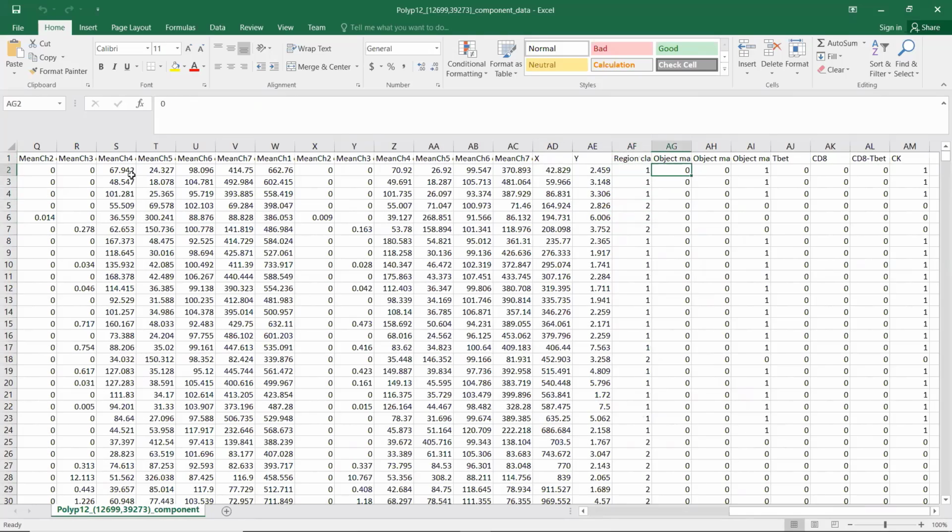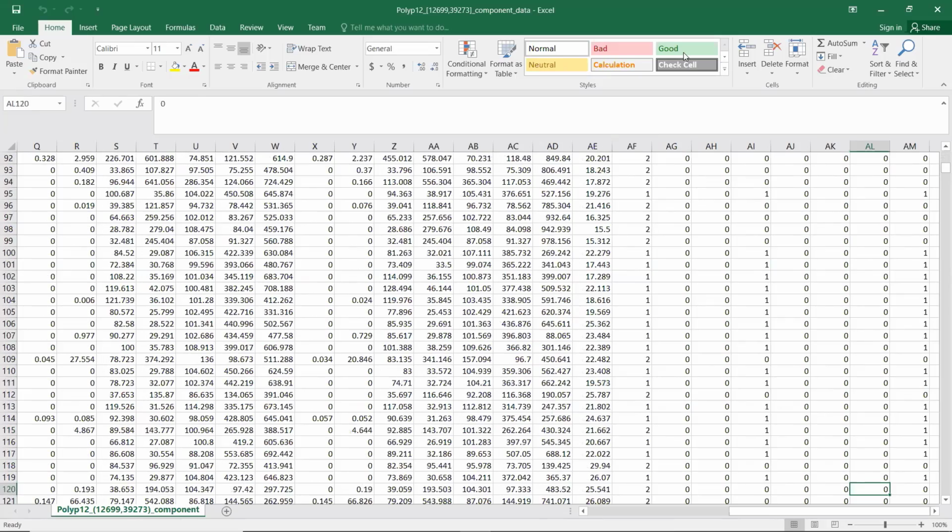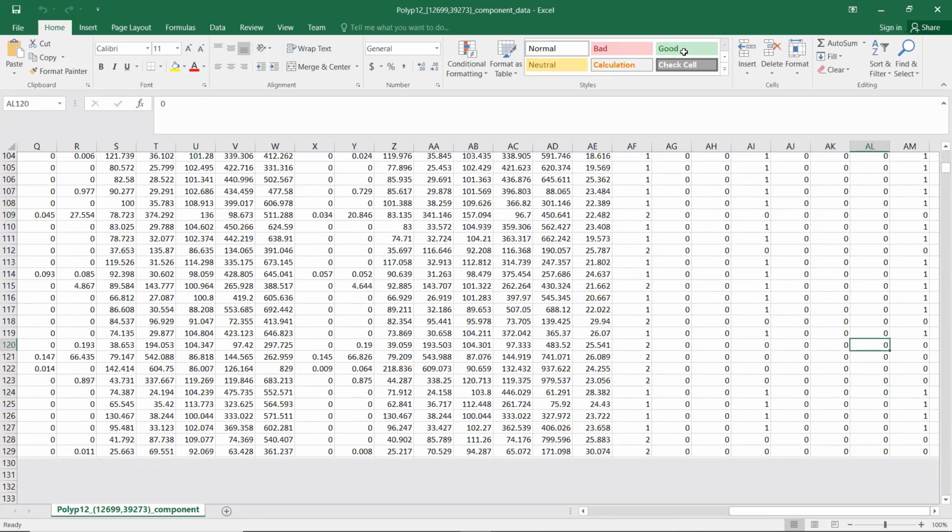And you have a label for your 3 markers. So for example, this cell is positive for marker 3, and that tells you that these nuclei are positive for cytokeratin, but you can also look at other combinations. So here, let's check.